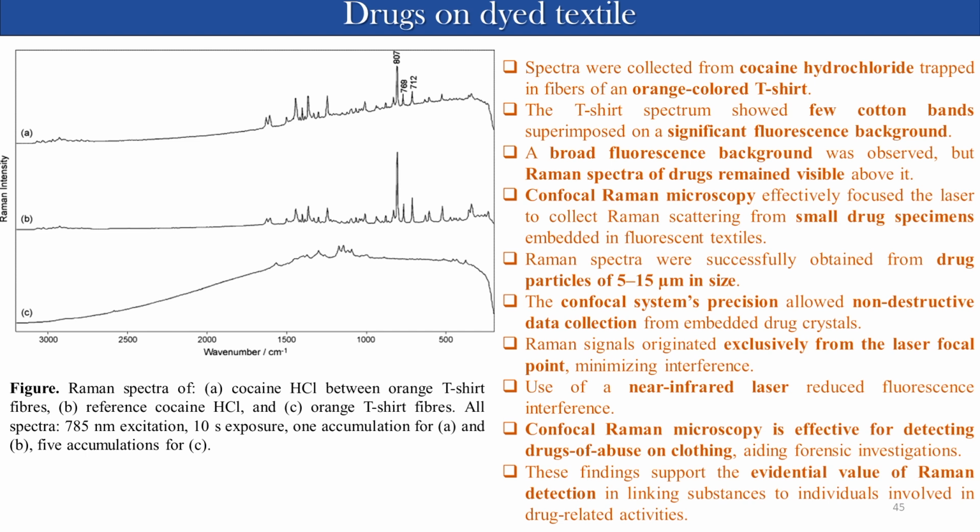Any question? Sir, I have a confusion: what is the fingerprint oil? Is it any solution or the production of our sebaceous gland? Yes, production of our own body secretion. It is also being tested by the spectrum. Yes, because finally, if you have a fingerprint, that fingerprint will have your own oil, this hand oil, and then protein, and then scalp. So everything is separately studied.